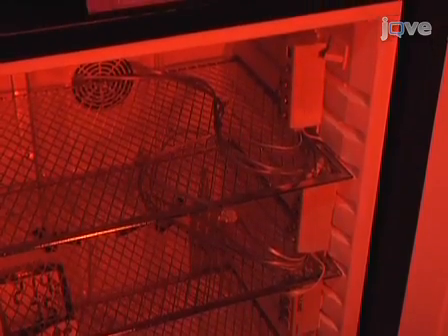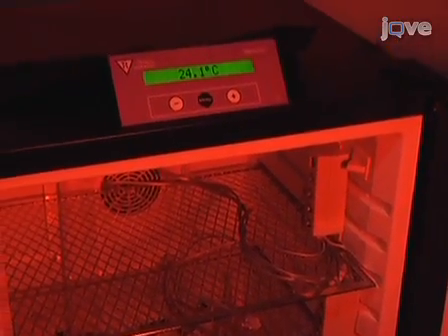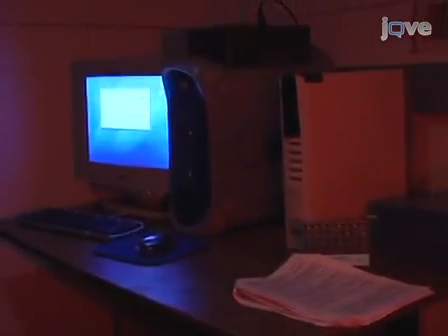Manually arrange the telephone line network neatly around the shelving of the environmentally controlled incubators to allow ease of plugging and unplugging of activity monitors. Set up multiple telephone lines in a way such that they will converge into one main line and extend out of the incubator to connect to the computer.